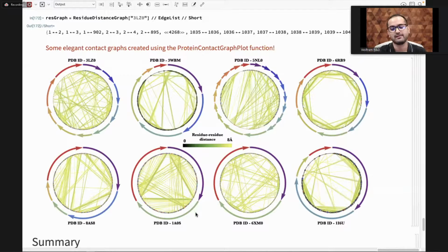And here, all the structures are also using scaled vertex size, where the vertex is scaled based on its connectivity. So this does help you see the broader scale structural aspects, or the coarse-grain structural aspects, of a protein, which I think can also be very useful on top of the contact maps.